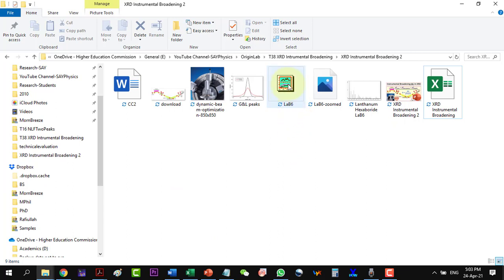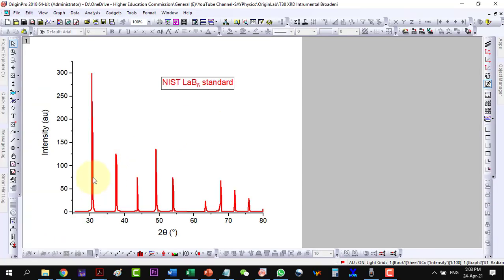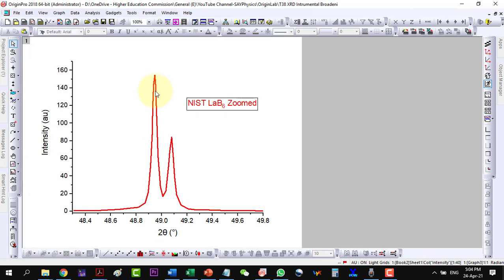Let's go to the Origin to start with the XRD data of lanthanum hexaboride. It is preferred to find FWHM of all these peaks and take their average value. However, if the difference that comes out is very less, we can focus on one intense peak somewhere in the middle and we will calculate its FWHM. Let me zoom this peak. We have already discussed in the previous video that the first peak corresponds to Kα1 and the second peak to the Kα2. I will focus on the Kα1.